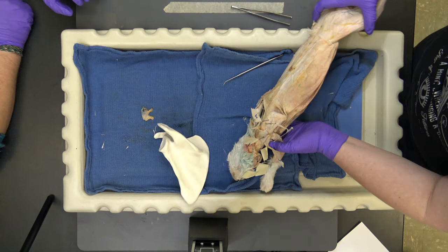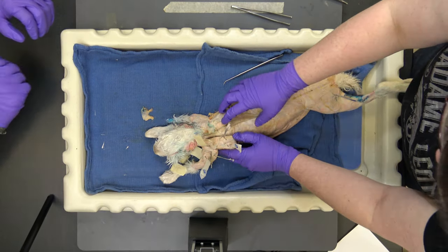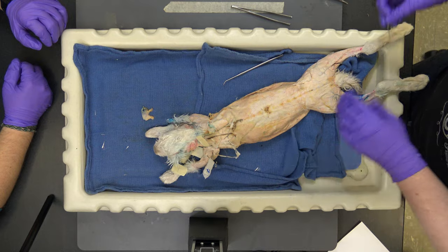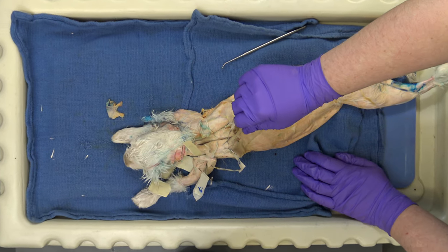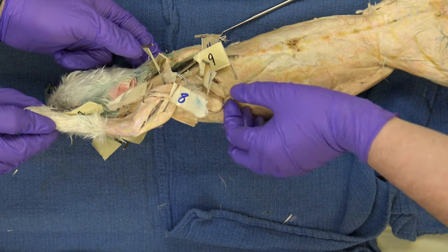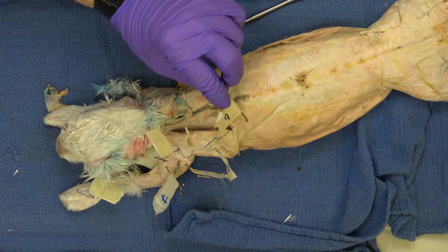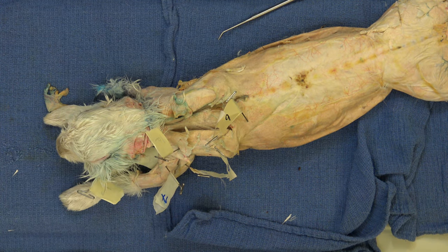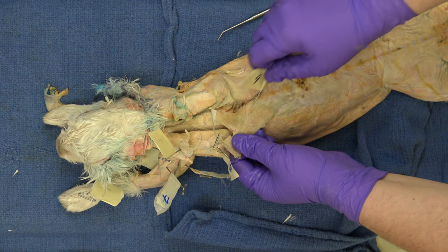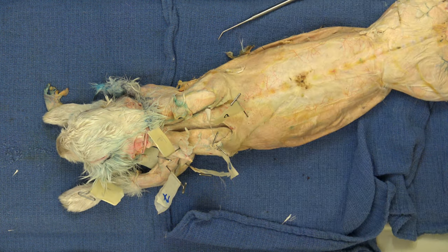Now we're going to move to the back. This is sometimes called the swimmer's muscle — this is the latissimus dorsi. If you do swim the backstroke, you're going to have a huge latissimus dorsi. Michael Phelps has a huge latissimus dorsi. It's this triangular muscle here, originating from the midline down the sagittal plane of the back and inserting on the scapula.